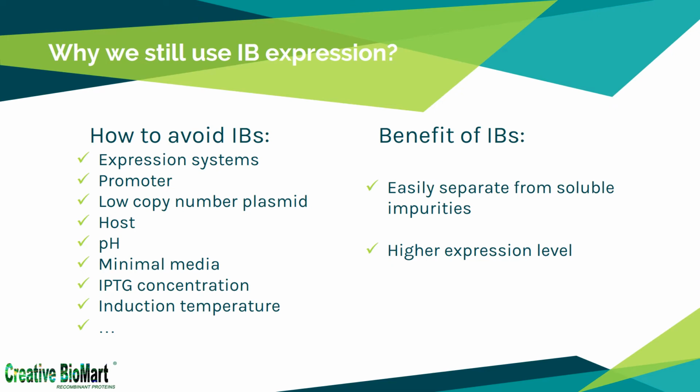When we express recombinant protein, we prefer the soluble state to the insoluble, for it is easier to work with a soluble starting material than insoluble IB. In order to increase the soluble proportion, we need to consider expression systems, including a different promoter, using a low copy number plasmid, or changing the host, and culture conditions, such as changes in pH, minimal media, concentration of inducer, induction temperature, and so on. However, even considering all factors, there is still a lot of recombinant protein expressed in IB form.